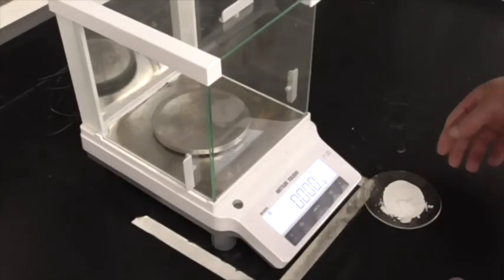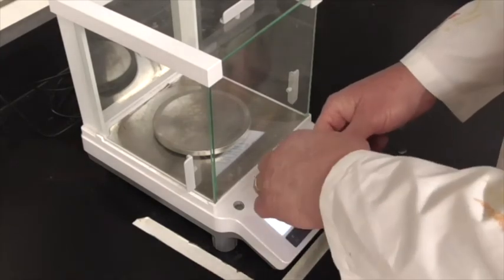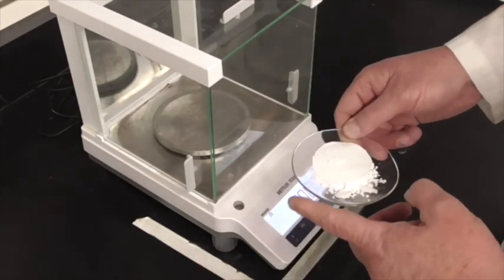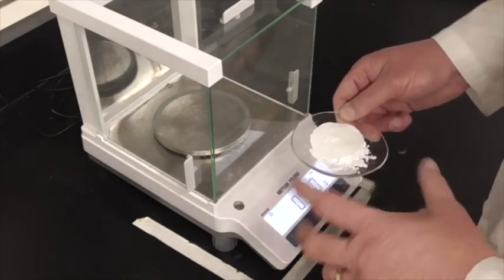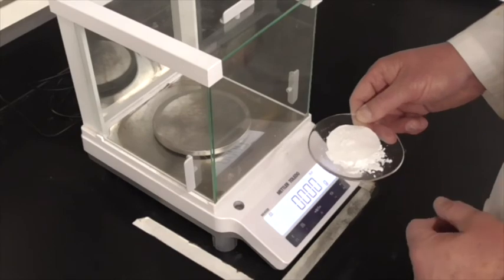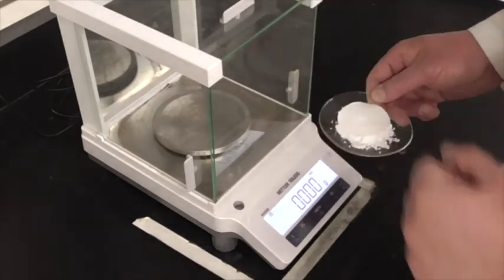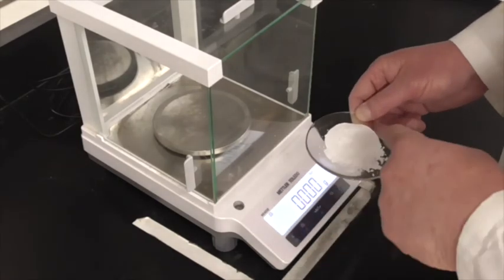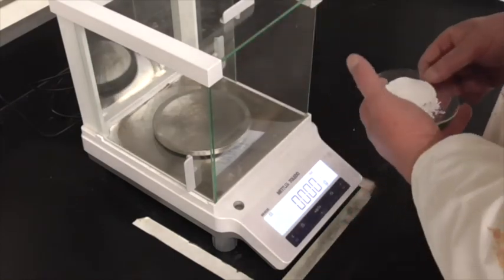All right, we're here at the balance. We've got our product here. It's dry. There's quite a bit of it. You can see it there. Remember, we weighed the filter paper and the watch glass separately, so we'll have to subtract those off of our total weight. So we need to do two things yet. We need to weigh our sample, so we can get our percent yield, and then we need to test the purity of our product. So let's get our weight, and then we'll go test the purity.